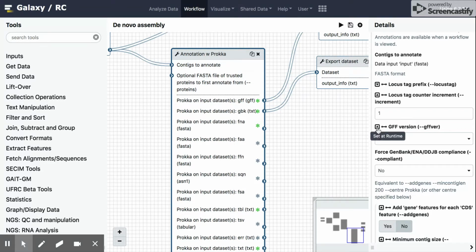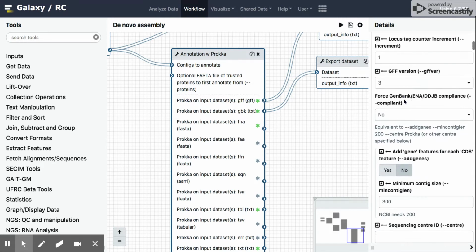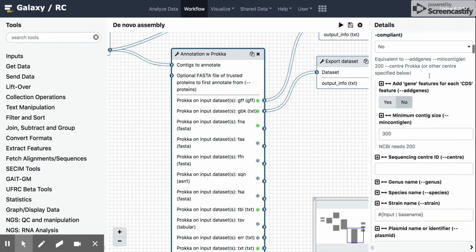And this is true for any variable on here where you see one of these areas that says set at runtime. So that's a good little point with this. So I'm going to leave that open again so that it just uses a default value in there.